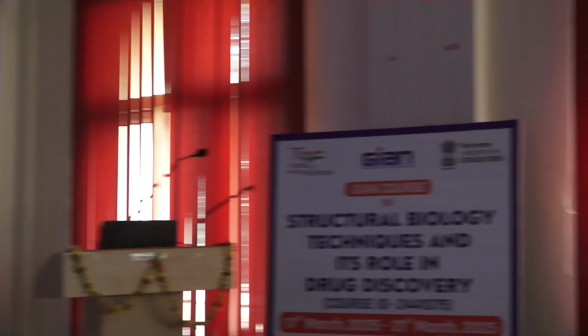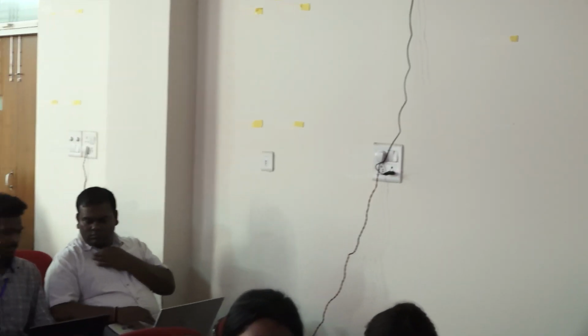You know how to zoom in? It doesn't zoom in like that. So you have to know how to control your trackpad. This is the right button in the three-button mouse. If you don't have a mouse and you don't know how to control the trackpad, it's going to be very hard.